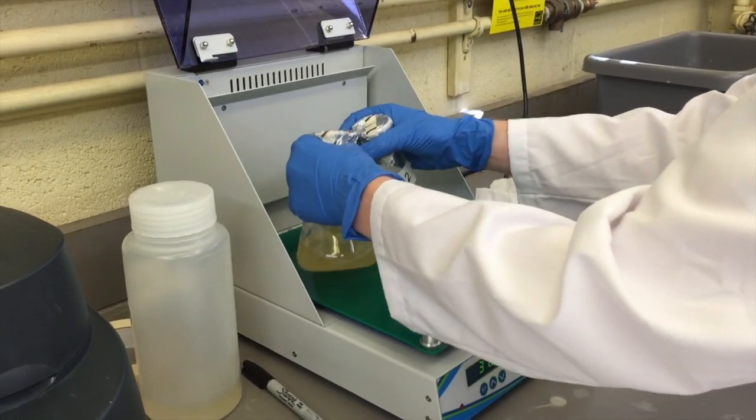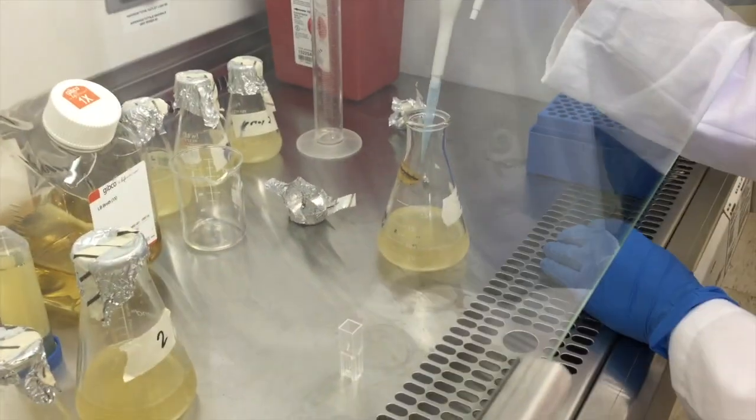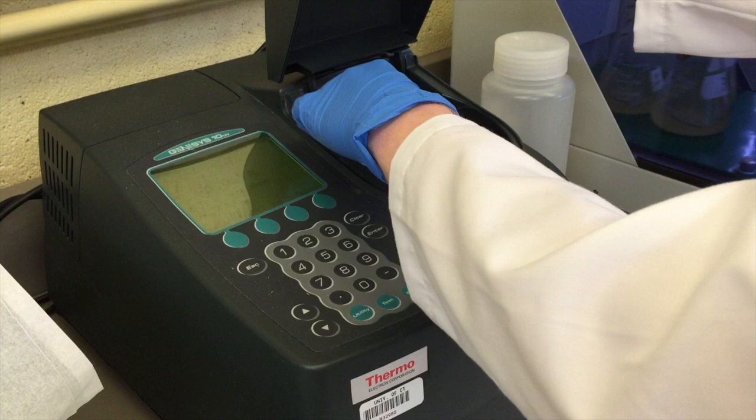Every 30 minutes, remove the flask from the shaker. Move it to the hood and pipette 1 milliliter of sample into a cuvette. Zero a spectrophotometer with a cuvette of pure media.